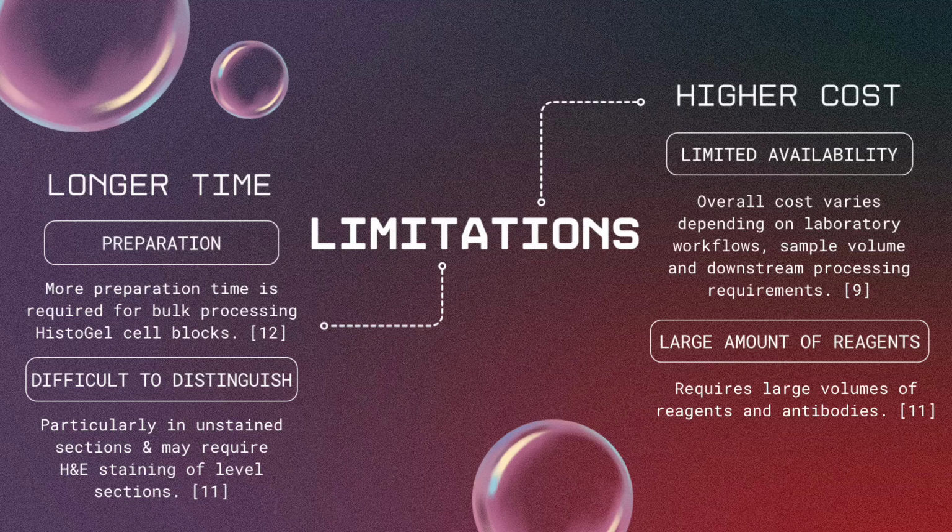Other time-related challenges include longer sectioning time for FFPE blocks, difficulty distinguishing cellular material from the matrix in unstained sections, and the need for additional H&E levels to confirm adequate cellularity.